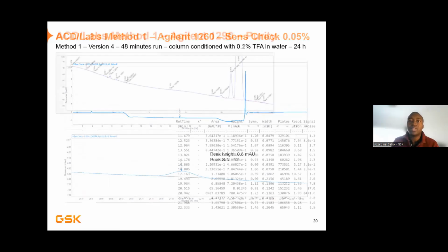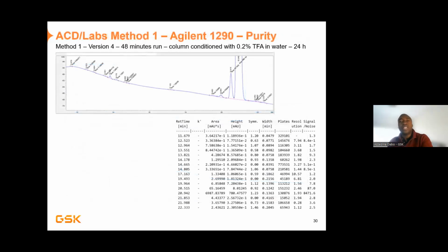And last but not least, what I was able to do then is overlay my sample injection against the blank and integrate every single peak present there to have an idea of what sort of impurities we have present and the levels of them as well.